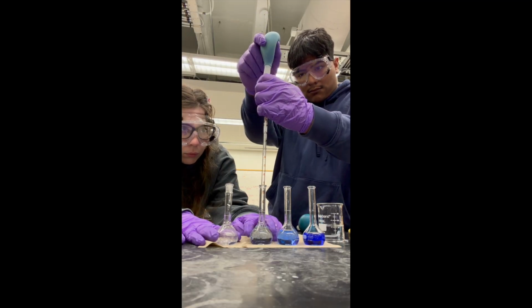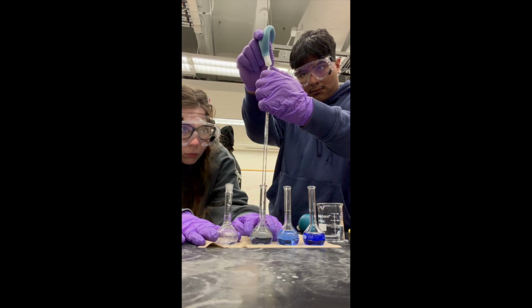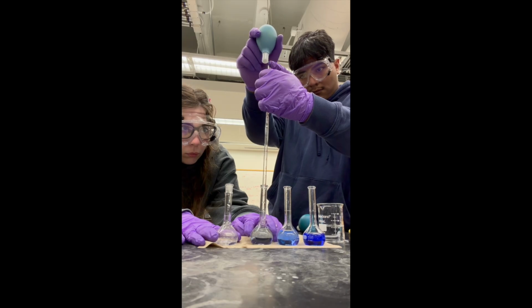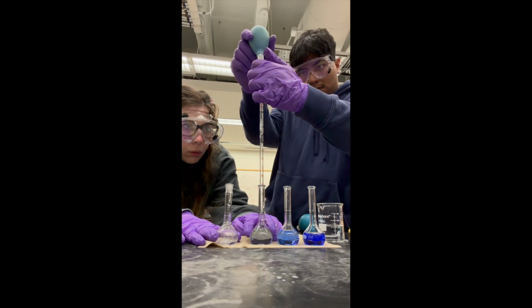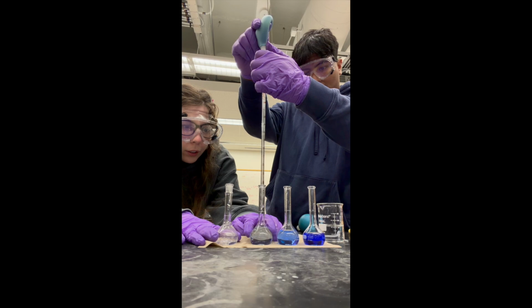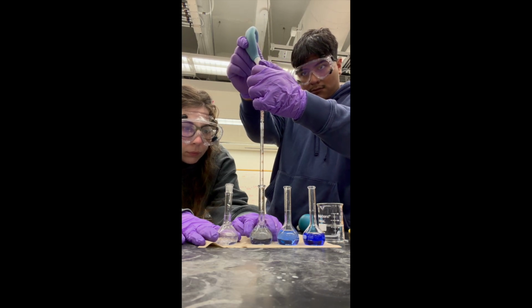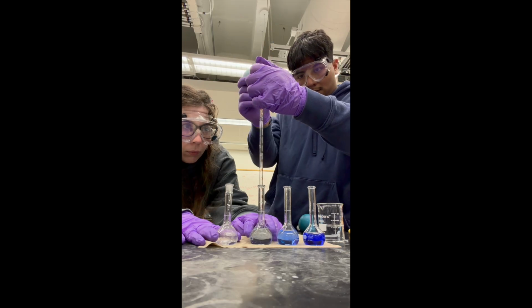The reason there is a meniscus is that, due to the adhesion and surface tension, the liquid curves up the sides of the container, making the bottom the most reliable, which is the meniscus. This is the reason we read from the meniscus.